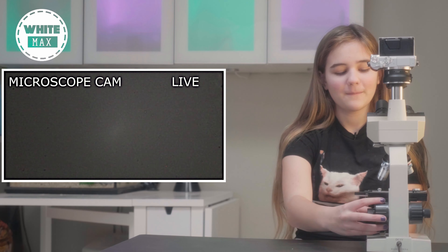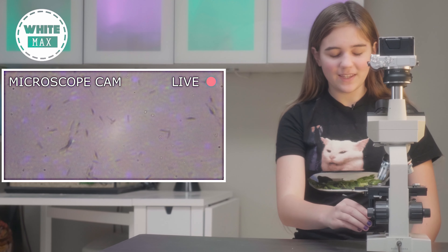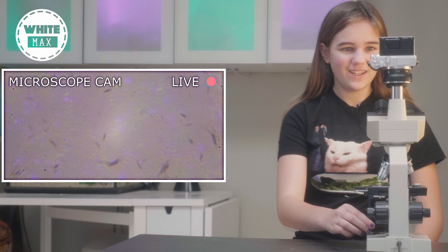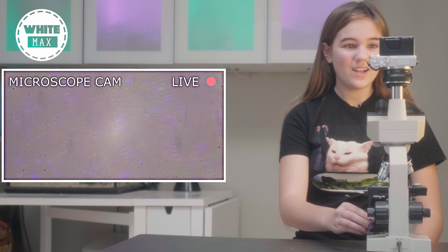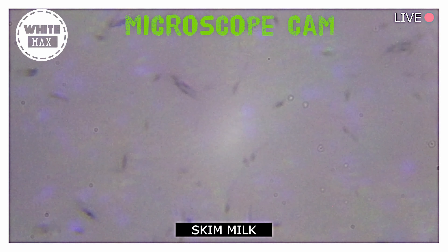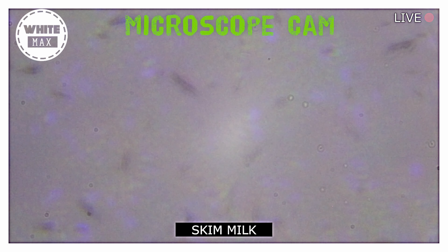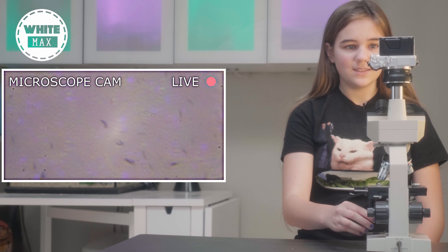Milk! Whoa! There's a bunch of like lines. They look a little bit like tadpoles, but they're not moving. There's just lines everywhere. I have no clue that this is what milk would look like. Lines, lines, lines everywhere. I guess this is just milk.